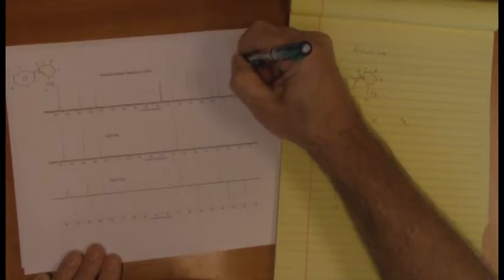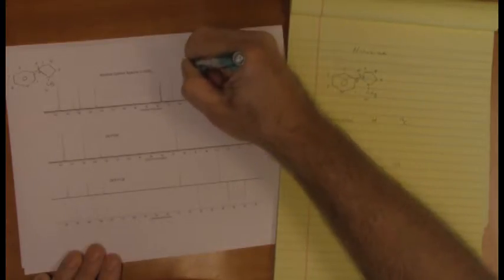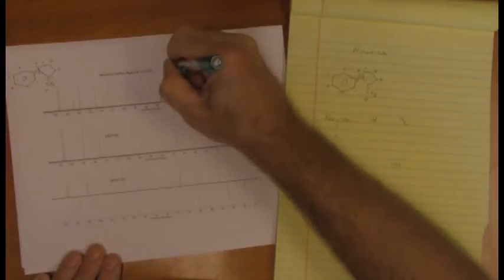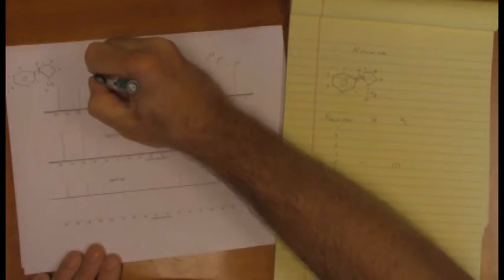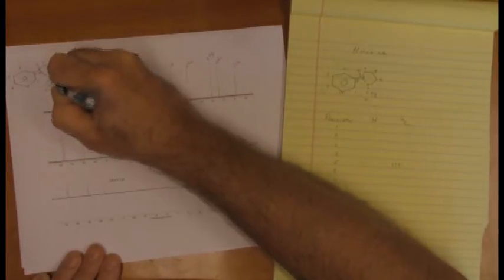For example, clearly, this one over here is a CH2, CH2, CH3, CH2, CH, solvent, and so we can say go away solvent, CH, CH, quaternary carbon, CH, CH. We've written these in on the carbon, and I am going to write them in on the HSQC as well. Yes, it's laborious and takes time, but it will save you much hassle in the long run.